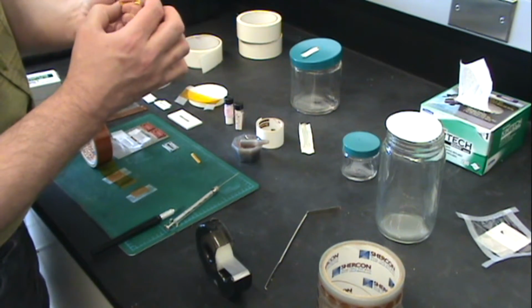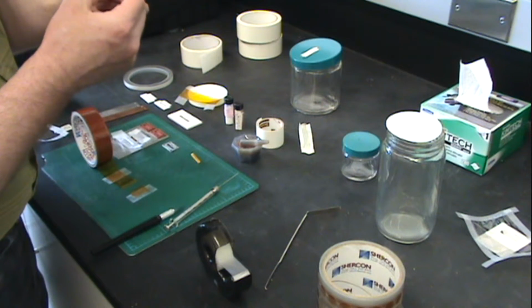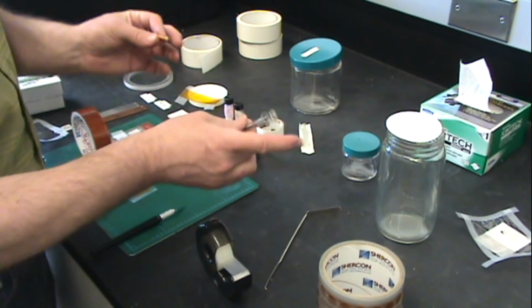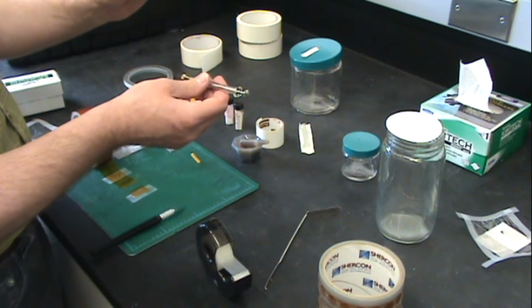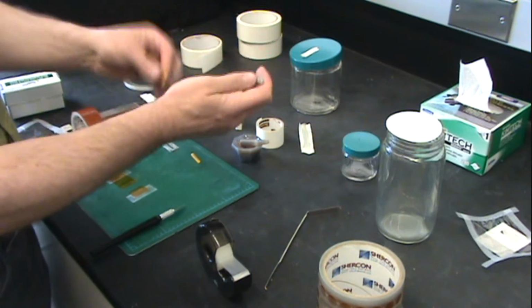I like to go through and make sure, push it down, that the seal is correct all around, again not touching the main window. And then the sample loading itself is relatively simple. This holds about 180 microliters, so use a 250 or 500 microliter syringe.